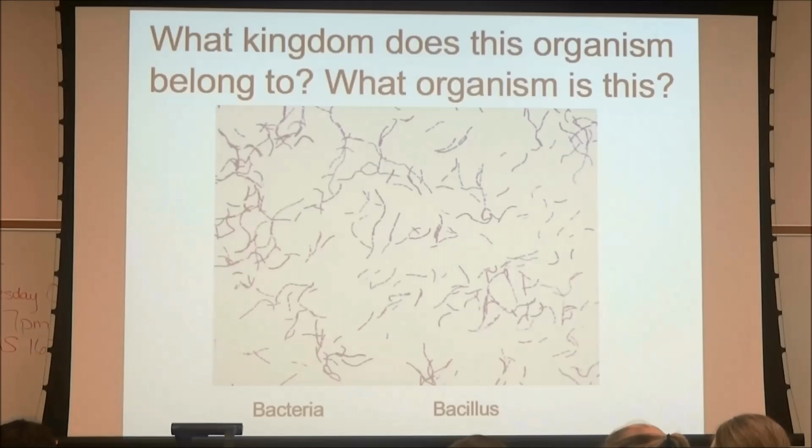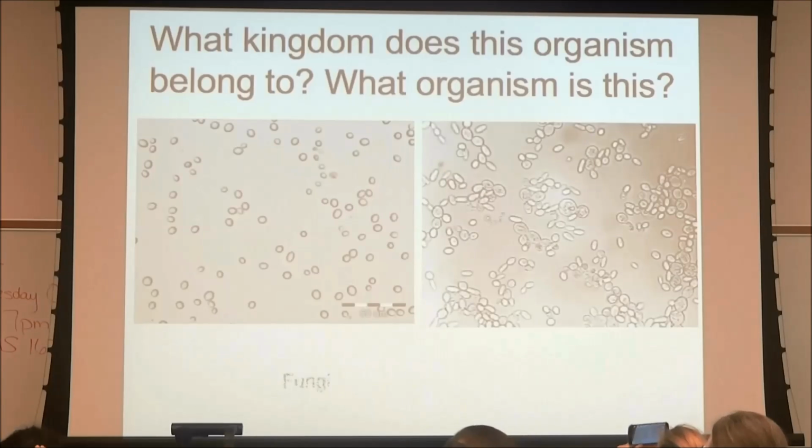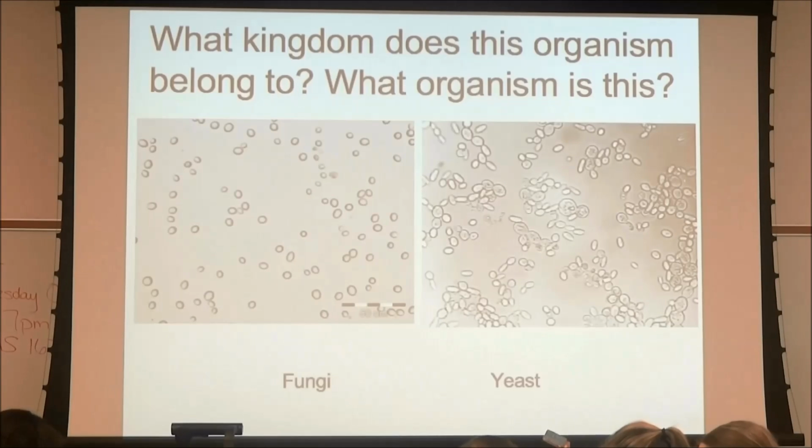You alright if I switch slides, guys? Okay. What's this? Fungi. Yes. What? Yeast, got it. Okay, this is your yeast. How did you know it was yeast? Unicellular. It's unicellular, good. What else? The shape, okay, it is circular.